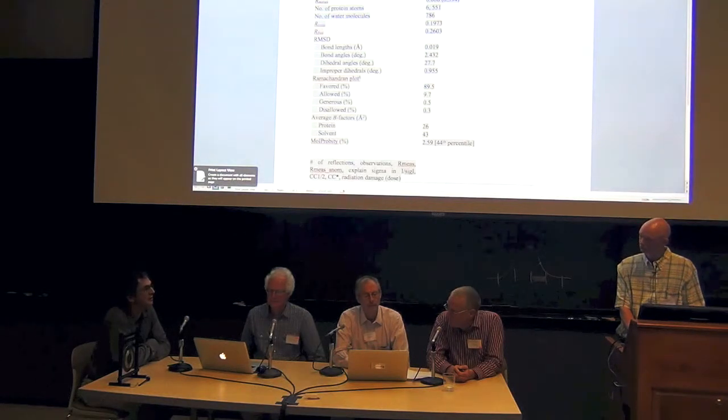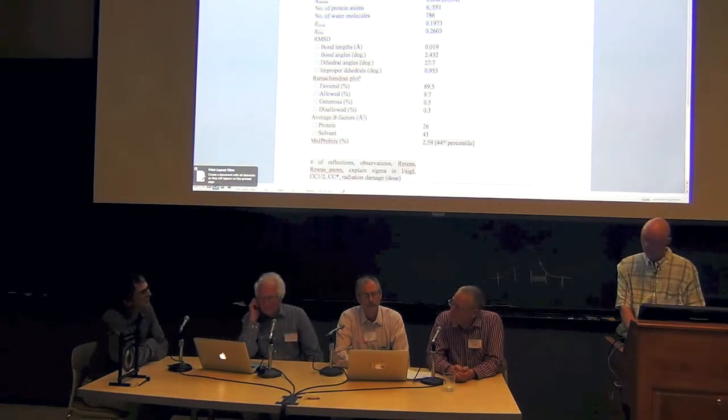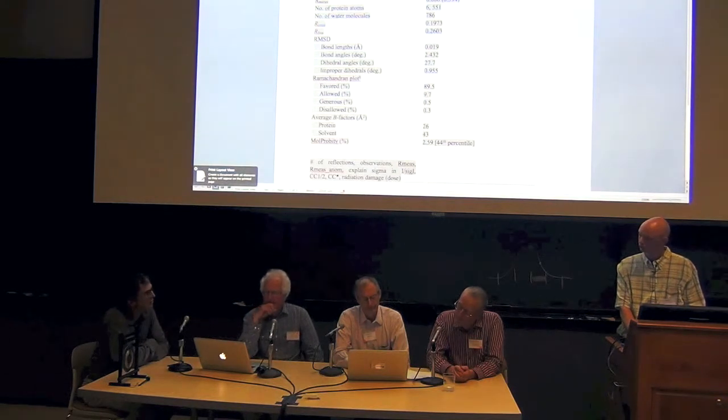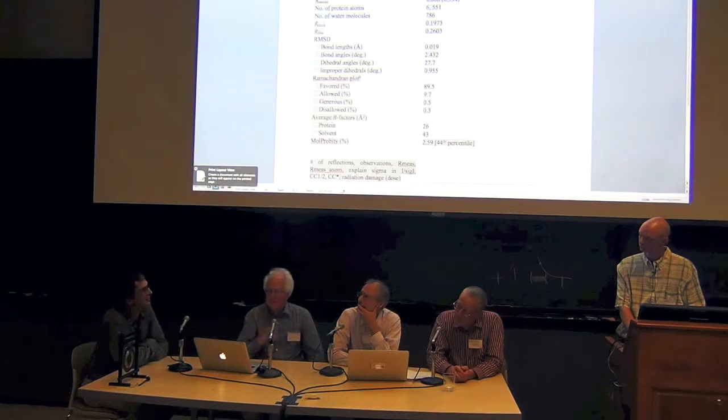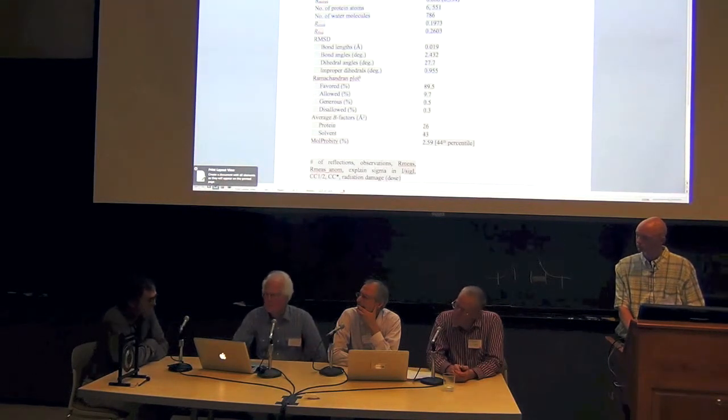At least the full dose is easy to get, in terms of, say, the increase in R-squared or change in the structure factors. Because there are two ways to quantify radiation damage: by decay, and by changing structure factors after decay correction. So those are two fairly critical aspects for some projects, and for other projects may not matter. So this is one thing.